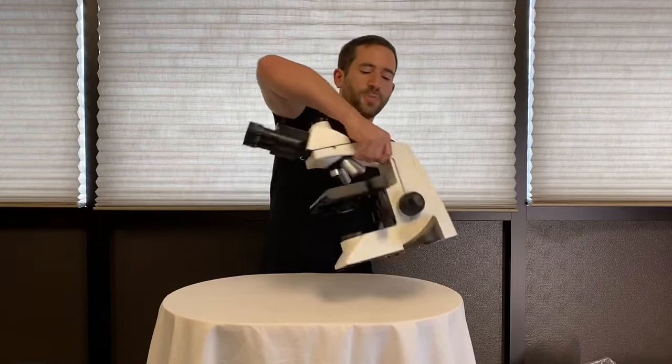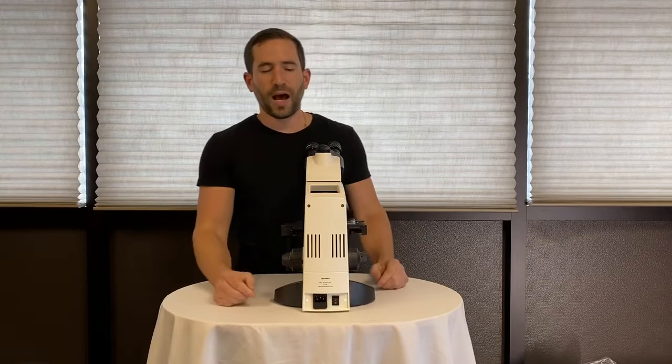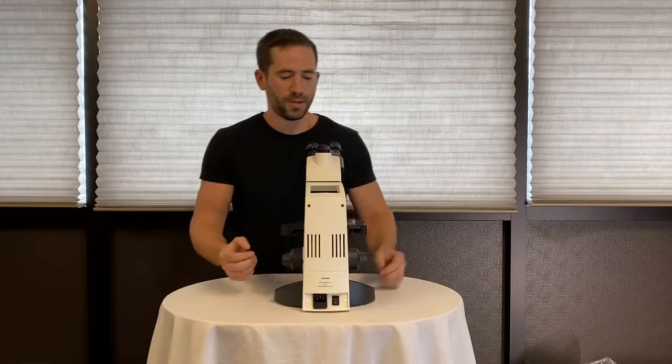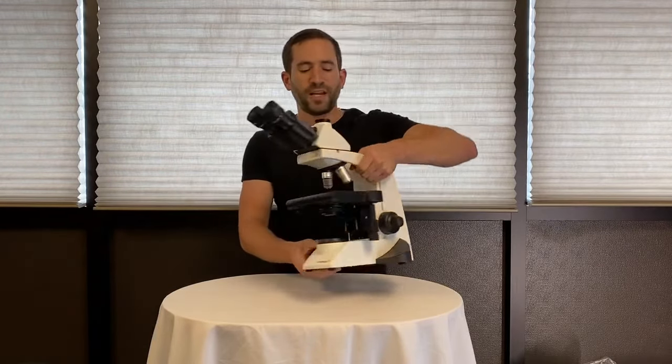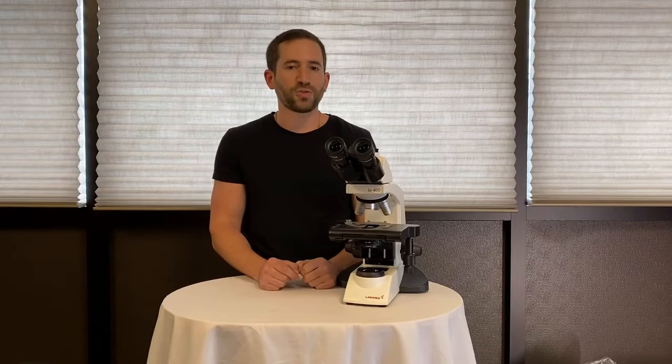The microscope has a convenient carry handle built into the top and there's an optional cord wrap that can be mounted on the rear. With LED illumination, it eliminates the need to change bulbs and provides little to no heat.